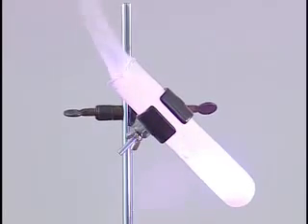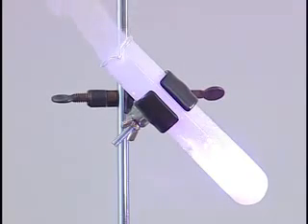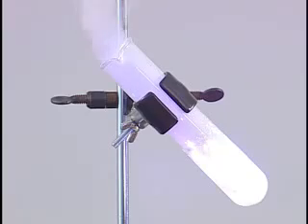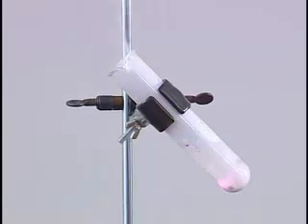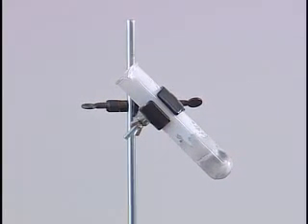Notice all the colors. That's light energy. That's the chemical bond energy being converted to light energy. If I was going to touch it, which I obviously won't do, it's really, really hot. So that's heat energy. And notice the substances coming out of the test tube. That's carbon dioxide and water, because that's what happens when the bonds of glucose in respiration are broken down.